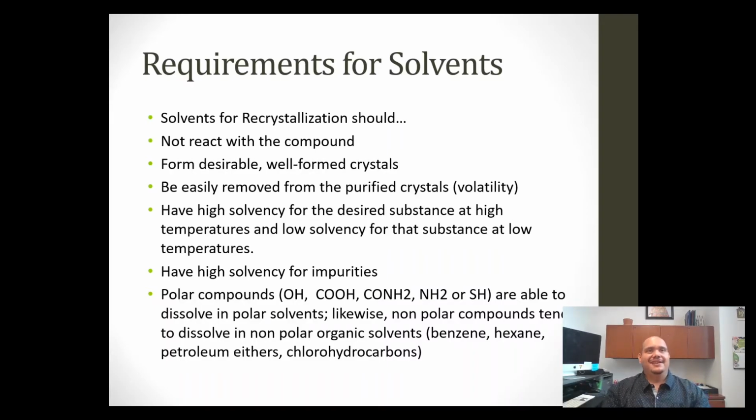You might notice that I'm stuttering a little bit. I'm trying very hard not to use the word crystallization or precipitation because we're actually doing recrystallization, and I want to keep that clear in your head. But a crystal is a crystal. It doesn't necessarily mean that we're crystallizing it. It's just what you get back. But remember, we are doing recrystallization, not crystallization, not precipitation.